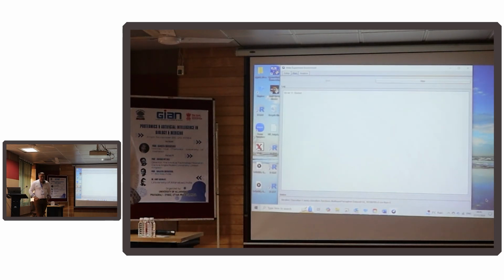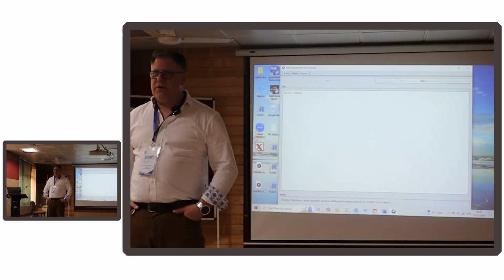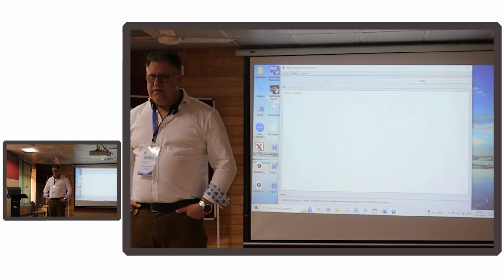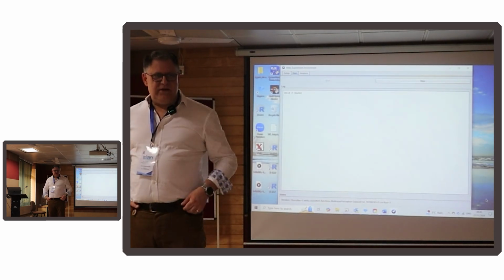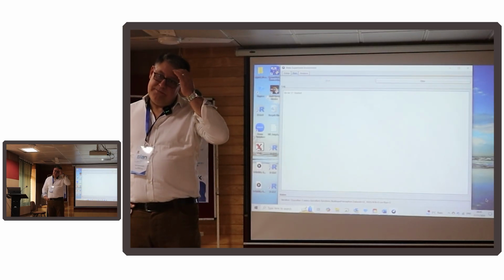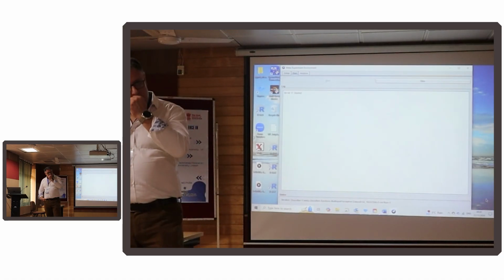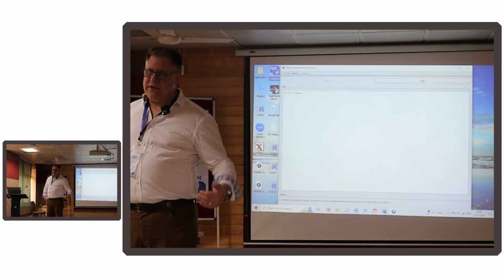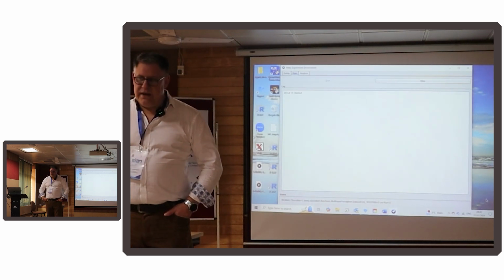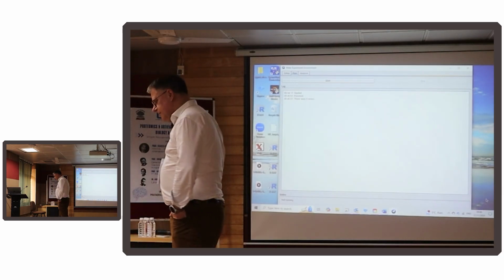Takes a little time. A lot of my role as a machine learning specialist or computational biologist involves me waiting for bars to move across screens and folders to fill up with files. When the algorithms are running, you don't see much, but the nice thing is you can automate something and let it run for a few days and then come back and harvest the results, which is quite rewarding.